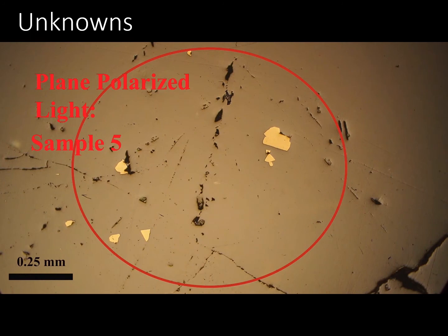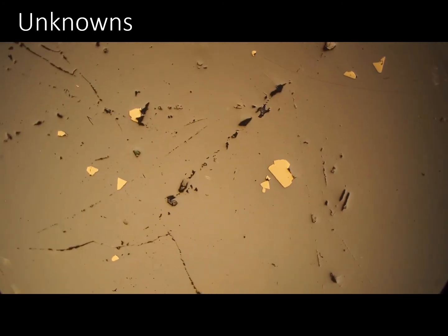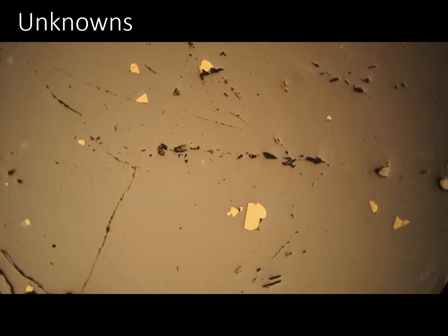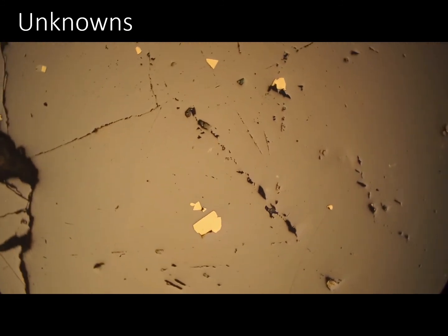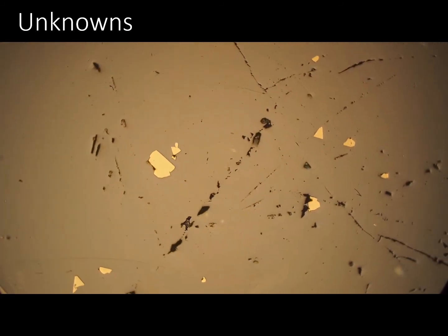And here we are, plane polarized light on sample 5. Here we are, cross polarized light on sample 5.